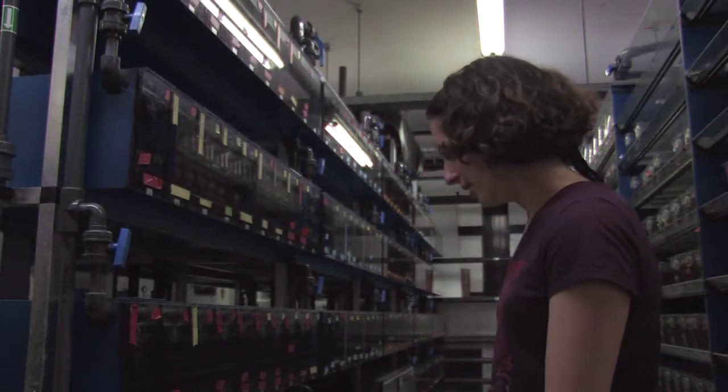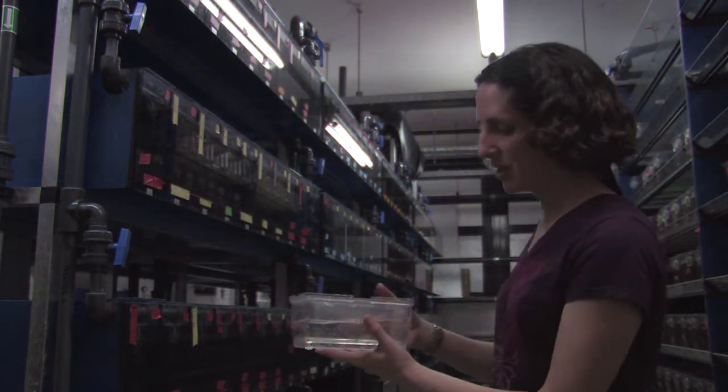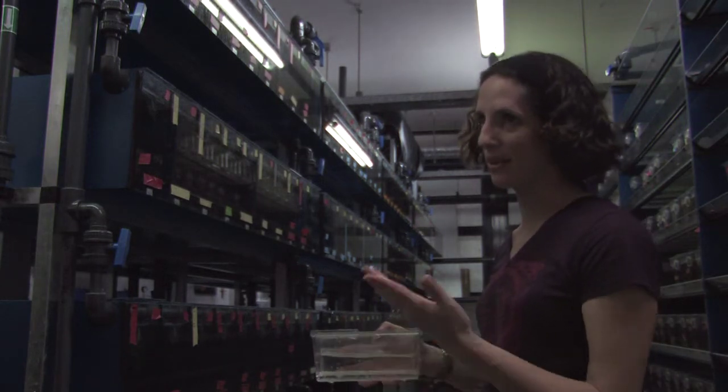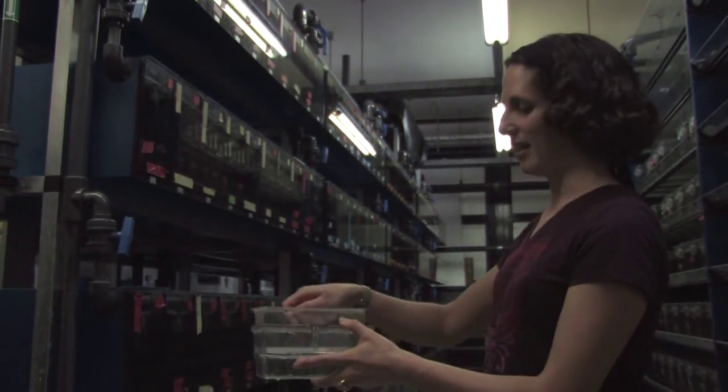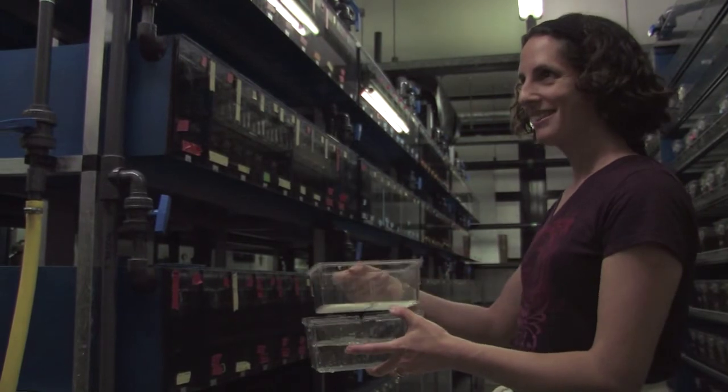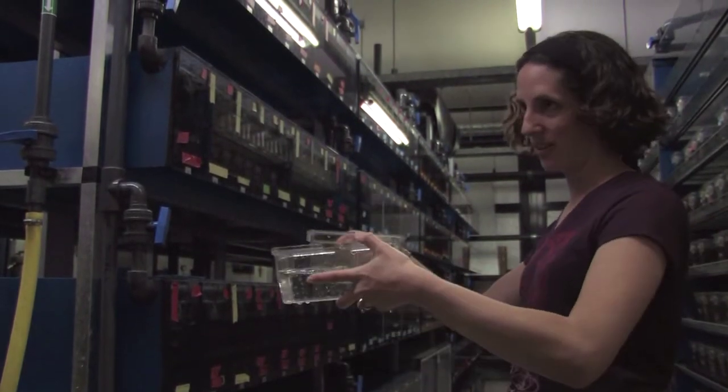They go in these tanks, and the fish will actually eat the eggs if they aren't collected because they want to get the protein back. In this tank, you lift this up and the eggs fall through. There's holes here. So the fish lay the eggs and they fall to the bottom, and then you take the fish out and you collect the eggs from here.